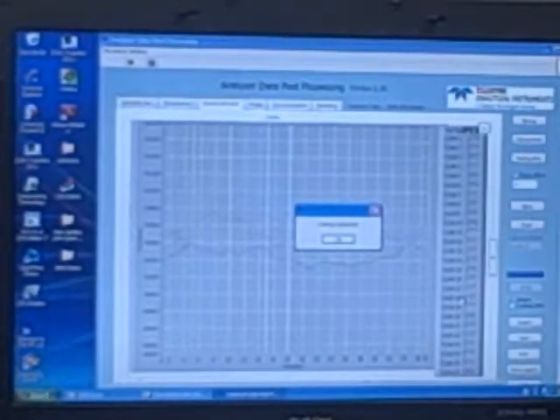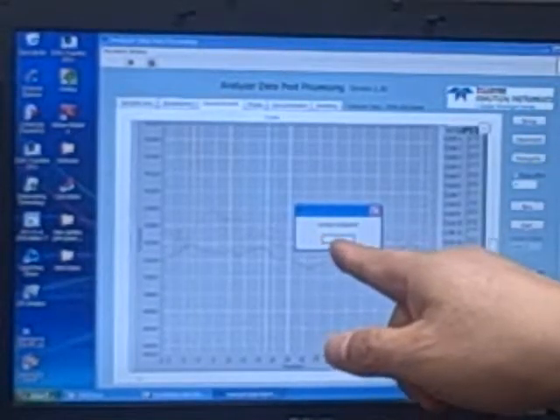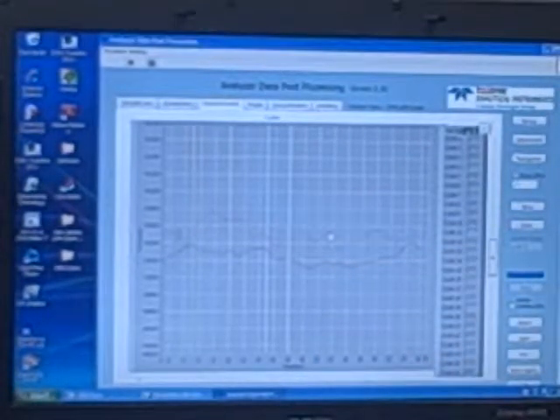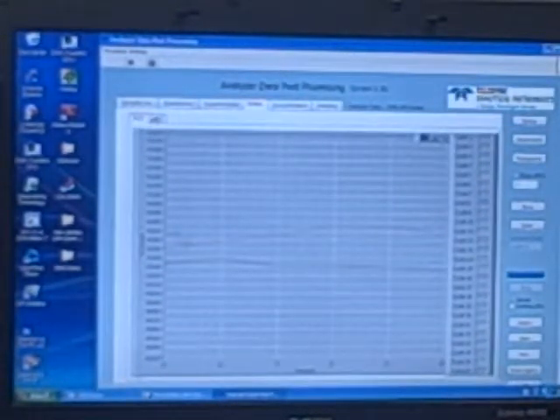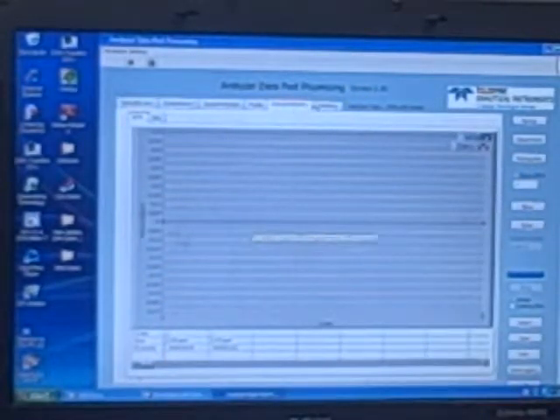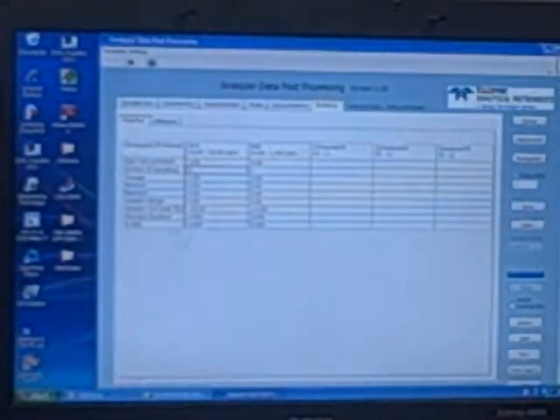Okay, it tells us done 2 cycles. So test completed. You click OK. So the data is there. And it also shows you where the peaks are, how the peaks are located, like acetaldehyde, benzene. Normally you will run the cycle time like 10 or 20 minutes, but for demo purposes only a few seconds. It also shows you the concentration, the product concentration as a function of cycles, statistics data. Now your job is done for this function.